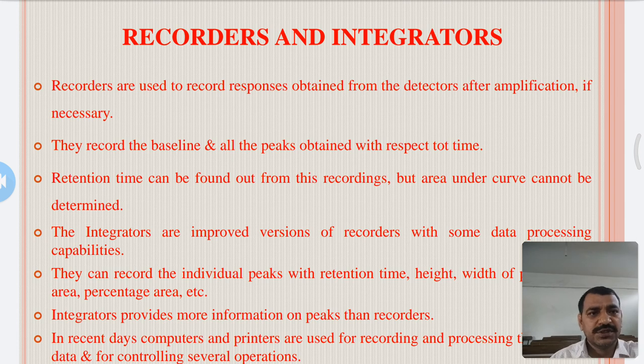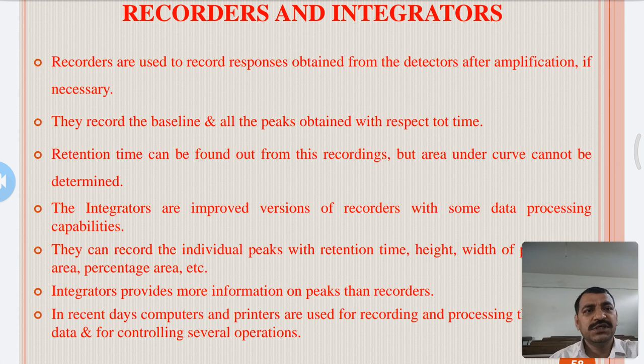Recorders and integrators. This is a very important part of the instrumentation of HPLC: the recorder and integrator. Recorders are used to record the response obtained from the detector, after amplification if necessary. They record the baseline and all the peaks obtained with respect to time. So the exact retention time can be found from this recording, but area under the curve cannot be determined with this recorder.